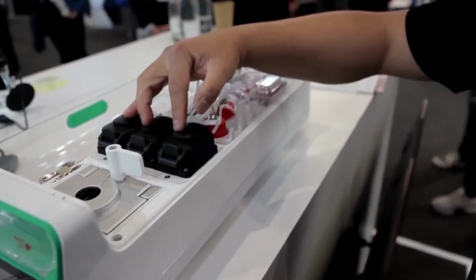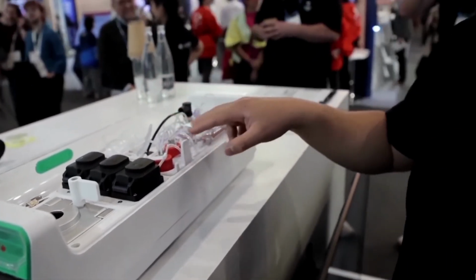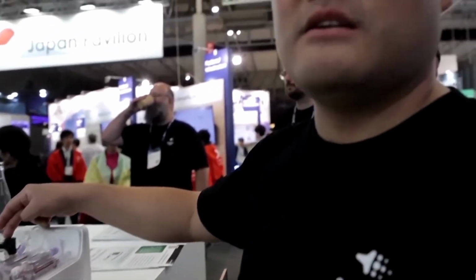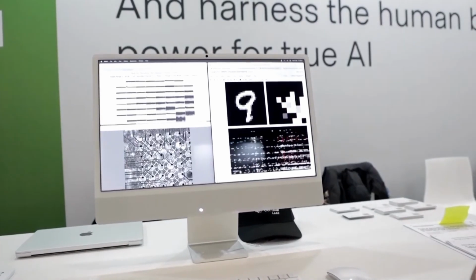Han explains that the neurons are cultivated on a silicon chip with small electrical contacts, linking them to the digital hardware, supported by an artificial life support system to keep the cells functioning properly. We have pumps that function like the heart, waste reservoirs, filtration units similar to kidneys, and a gas mixer to regulate carbon dioxide, oxygen, and nitrogen levels.